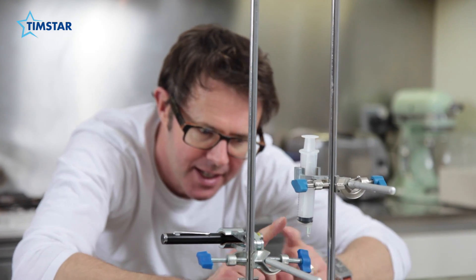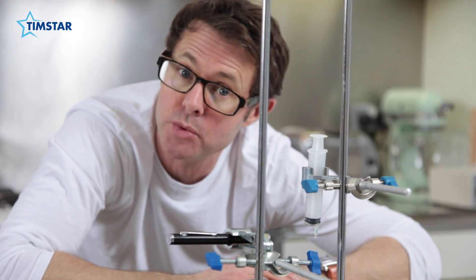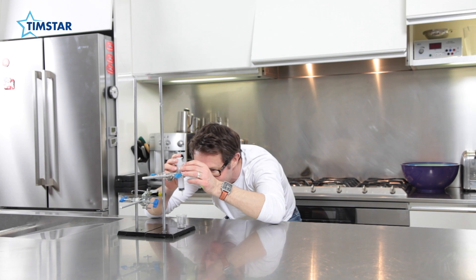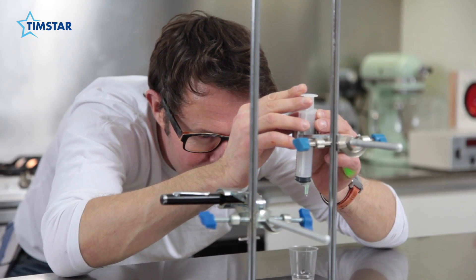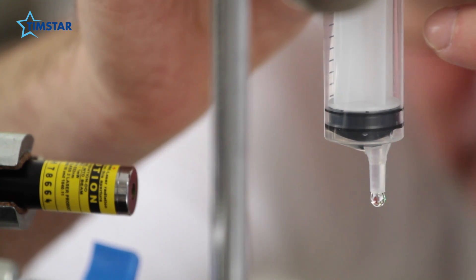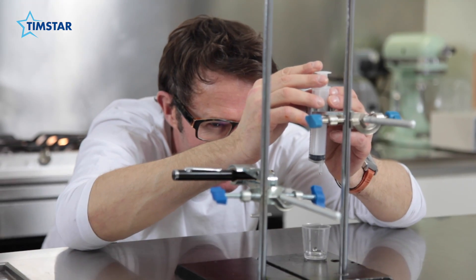What I've got in here is just a tiny little bit of pond water and I've watered that down as well so it's in solution. And then you need to fiddle around with it to get the pond water to form a really beautiful droplet underneath the syringe.